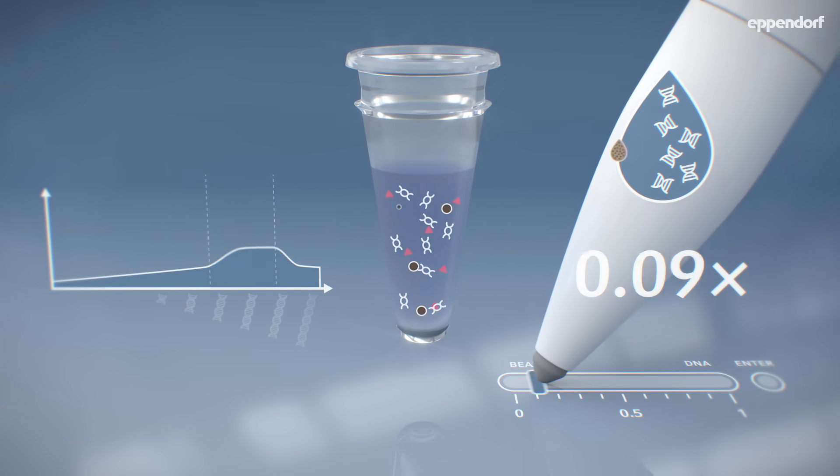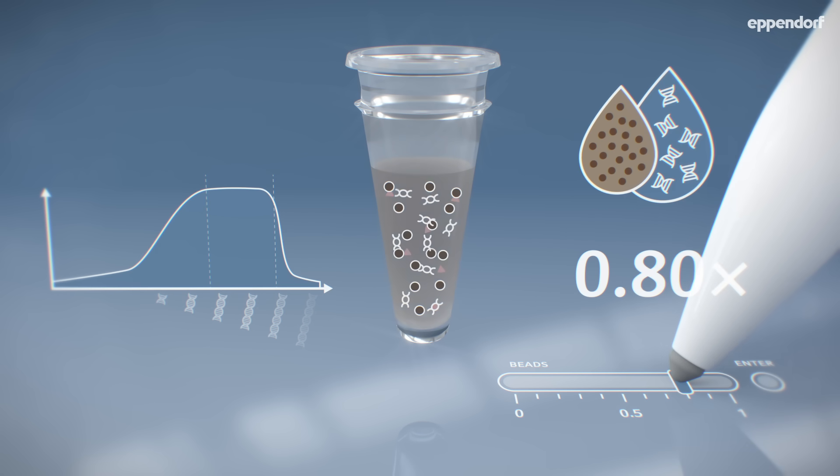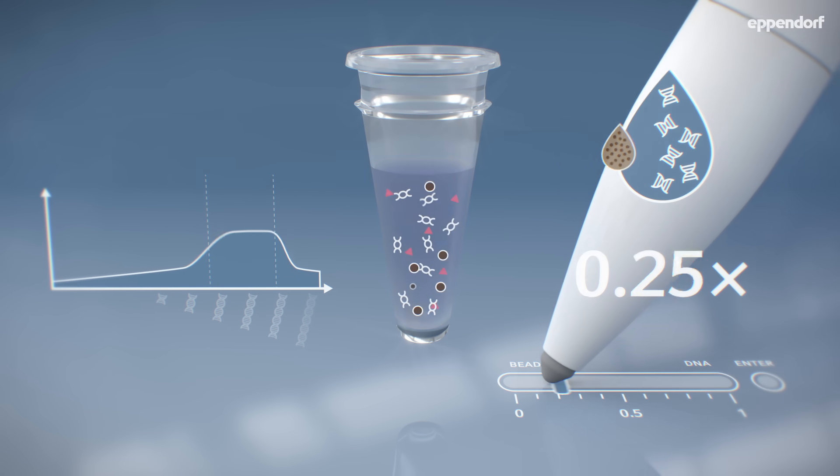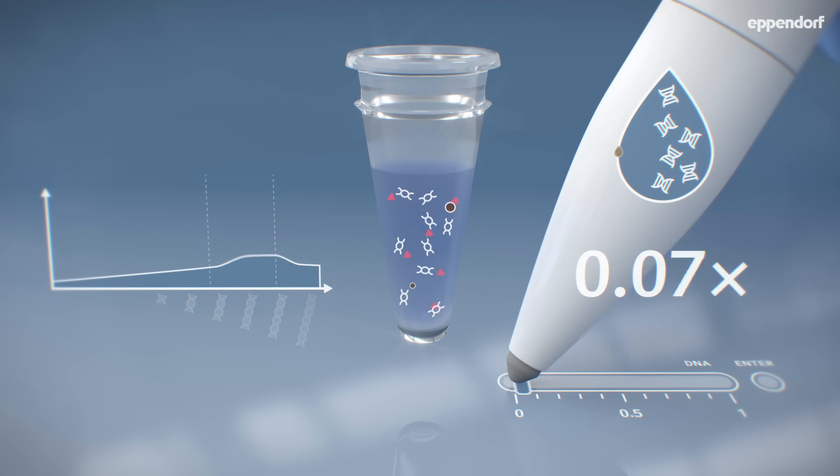The first step is the binding of the beads to the sample. The volumetric ratio of beads to DNA sample will influence the length of the DNA fragment recovered. Let's play around with that ratio.